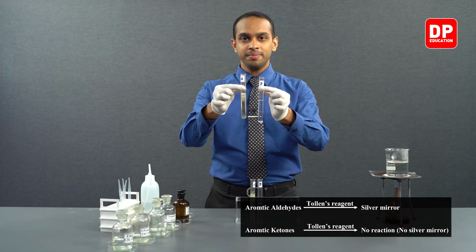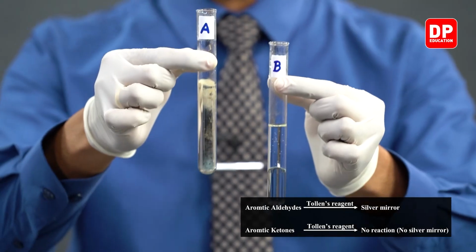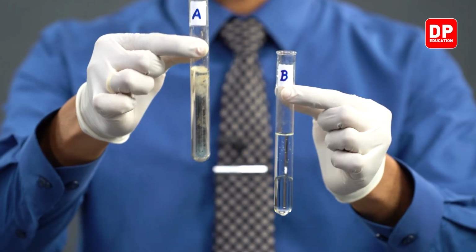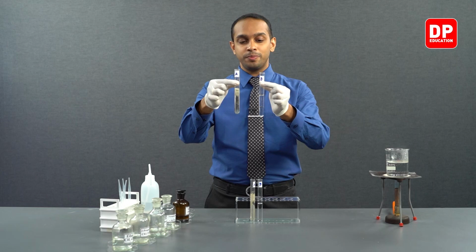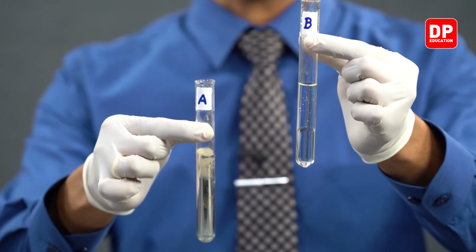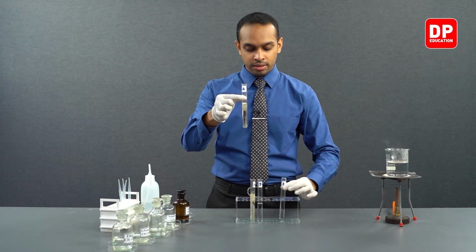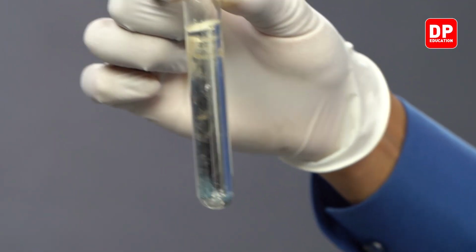The test tube A containing the aromatic aldehyde has answered positively to our silver mirror test, forming a silver mirror inside the test tube. And the aromatic ketone containing test tube B has not answered positively to the silver mirror test. So, we will set it aside for a while and let me remove the contents of this test tube.